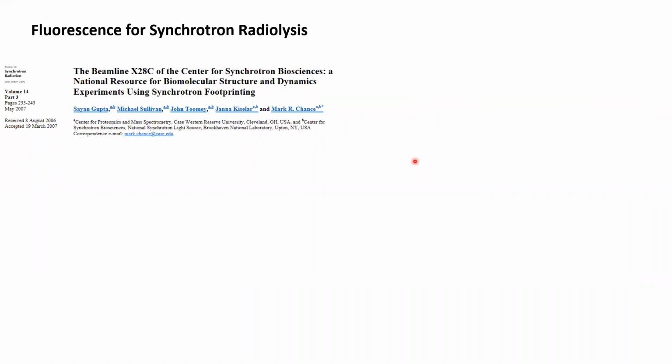Since hydroxyl radicals will react with a wide variety of things, this radical scavenging is always an issue that needs to concern the experimenter in hydroxyl radical protein footprinting. And the method for measuring and correcting for hydroxyl radical scavenging has been with us for most of the lifetime of the hydroxyl radical protein footprinting method itself. This technology is known as hydroxyl radical dosimetry, a method for measuring the effective amount of radical and the scavenging capacity of your buffer or of your system.